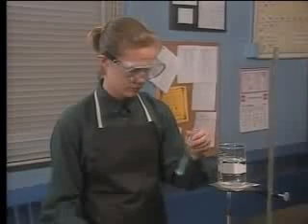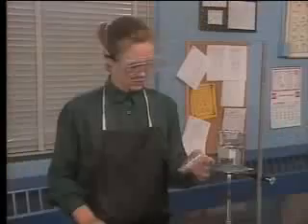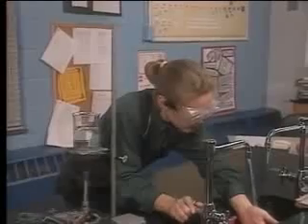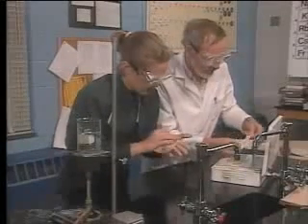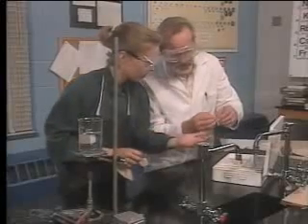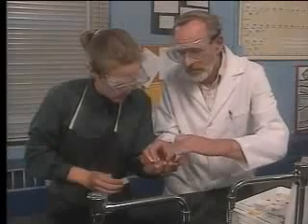In spite of safety precautions, people sometimes get careless and accidents happen. That's why a well-equipped chemistry lab has emergency equipment to take care of them. If you've cut yourself, wash the wound to remove any chemical traces. Make sure there are no pieces of glass in the cut. Dry your skin carefully so a bandage will stick. Let your teacher put the bandage on the cut. Notify your teacher whenever you have an accident, and make sure to get immediate medical attention after any injury in the lab.